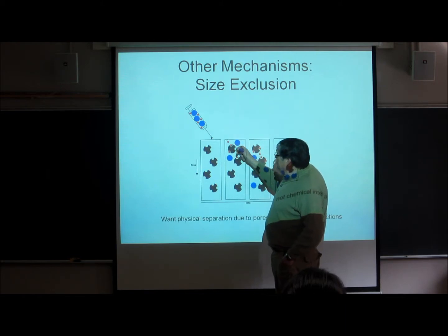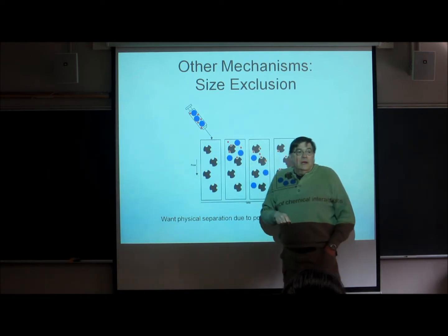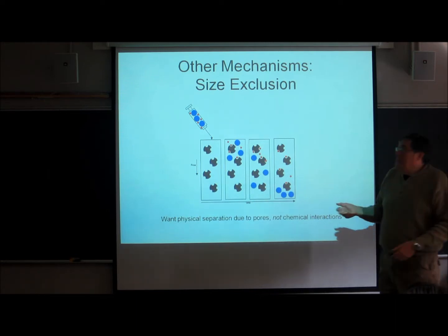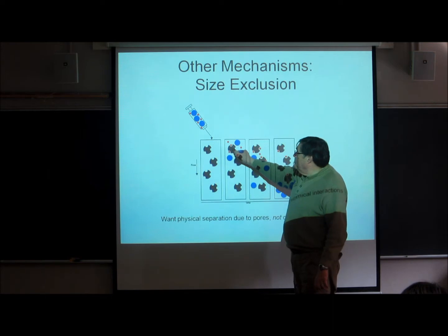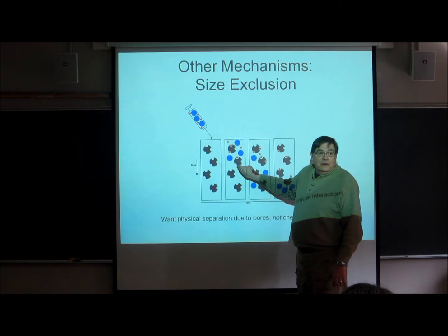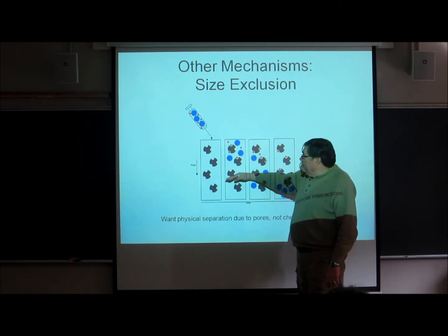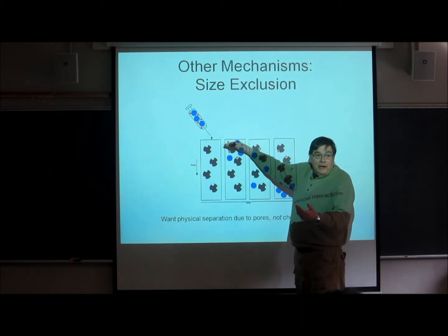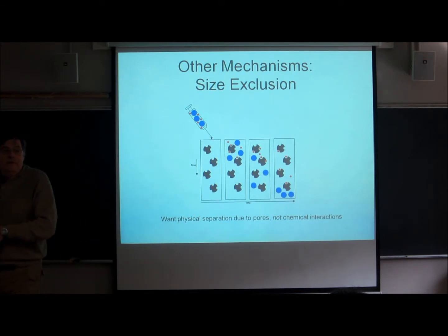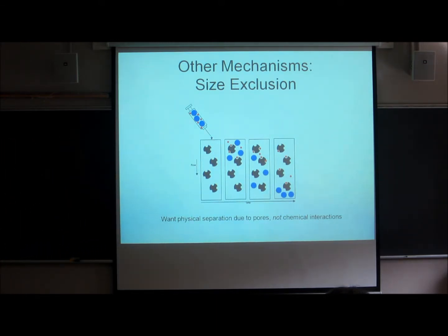The proteins try to get into the particle as best they can by diffusion, right? They go from where they are to where there aren't so many of them. They're loners. And what we find is that the little proteins can dig down into the pores much more deeply than the big proteins. After the whole mess of proteins goes by and the concentration up higher in the column declines, diffusion outward occurs, right? Now, if you're a small protein and you've gone deep inside this path to get way down into the particle, it's going to take you longer to get back out again, isn't it?